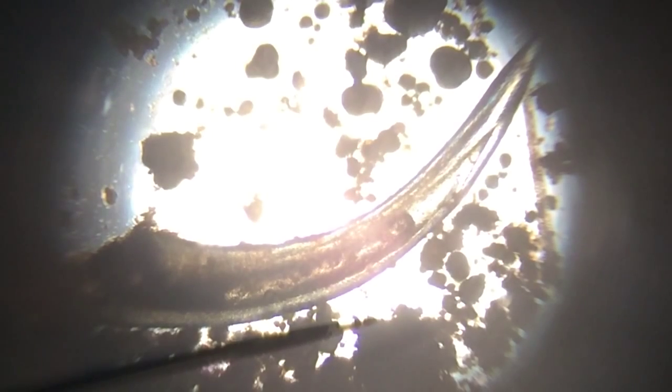Look at that, it's just so cool. I think I'm going to put it on my necklace, even though this is 100x magnification. It'll be a small necklace, but I will do it.